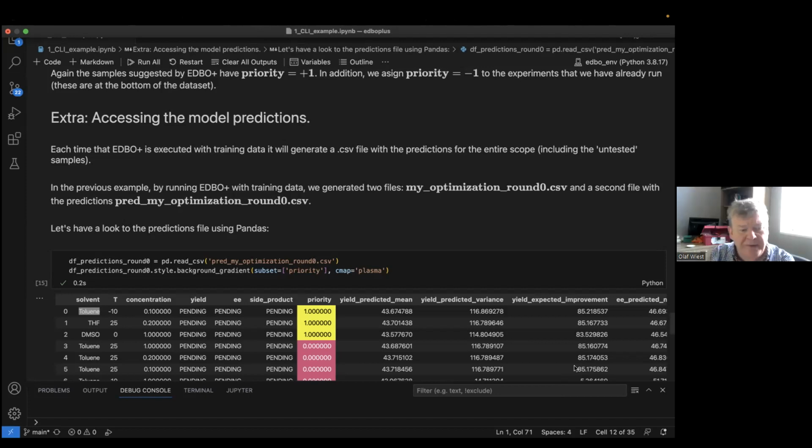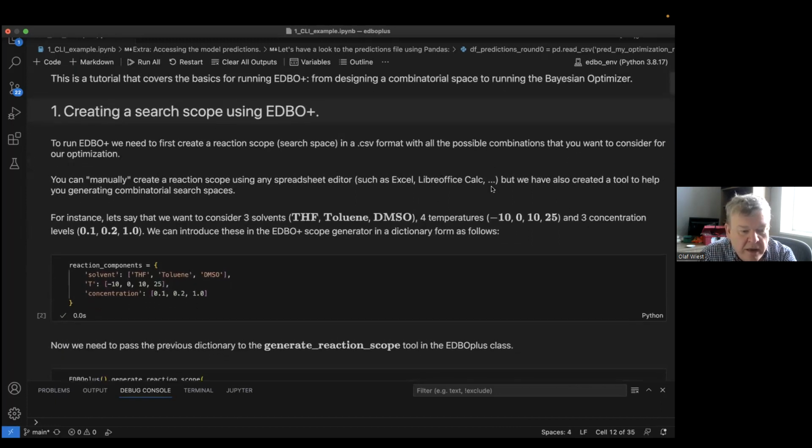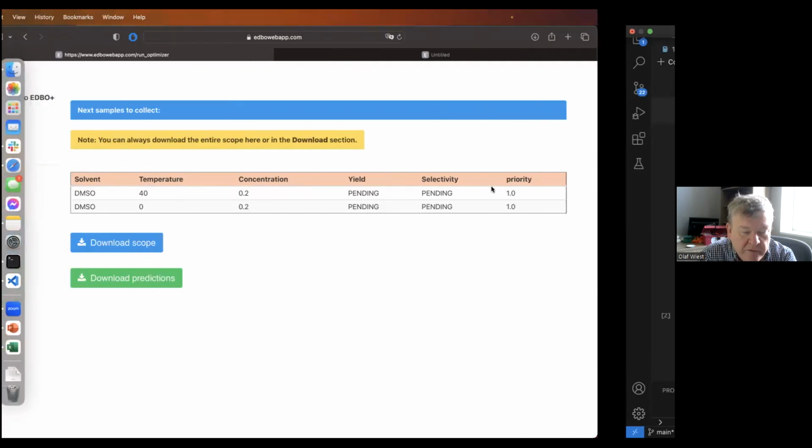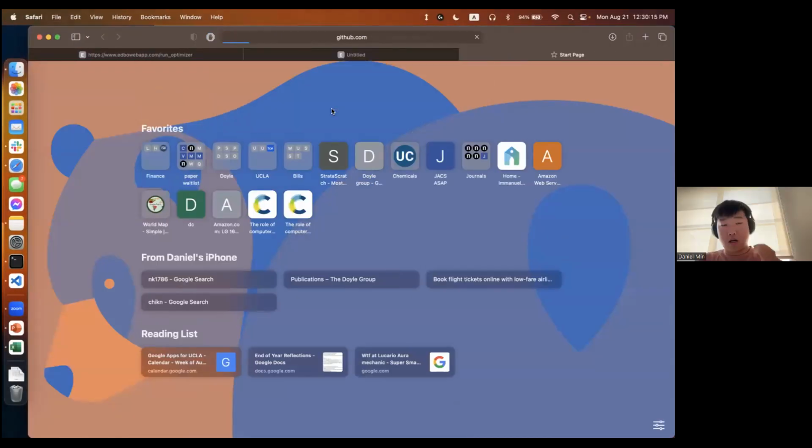I have one more question regarding the technical details of the GitHub part, because particularly in industry, people might be somewhat reluctant to use the website. So other than the Python code that you have on GitHub, are there any other things that need to be linked to run the optimizer, or any particular environments that they need to set up in order to do this? Yeah, that's a good question.